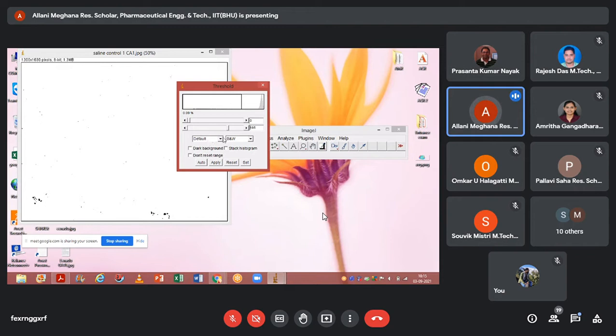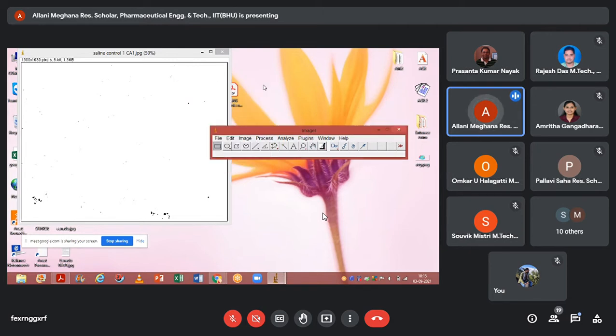Here, by default, it will show Default. We just keep it as such. Here you will find red, black and white, and over and under, these three drop-downs. From these drop-downs, select black and white. If it is already black and white, then you don't have to do anything. Then just exit from this box, click the cross, and come out of it.